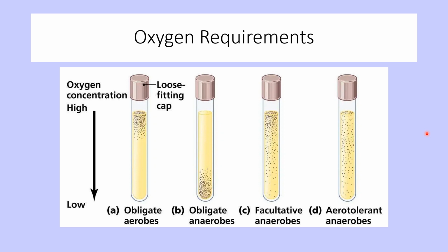So learn to be very observant and make note of these various characteristics, whether it's growing on a petri dish or whether it's growing in a broth. It can tell you a lot of information.